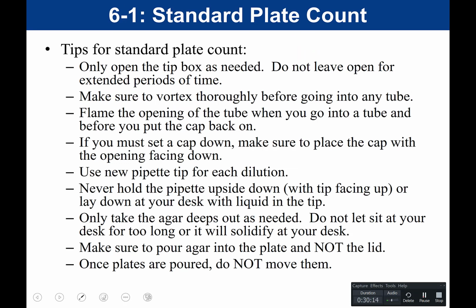We don't want to keep the lid off the tip box for long periods of time because the tips are sterile. They have been autoclaved, meaning they've run through our autoclave, which is a giant pressure cooker essentially, which makes the tip sterile. If we leave the lid open for long periods of time, those tips are no longer sterile because things from the air could fall in. So we make sure that our tips are only open as long as we need them, and then we close the lid right away.